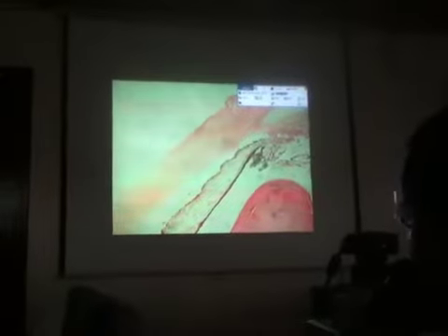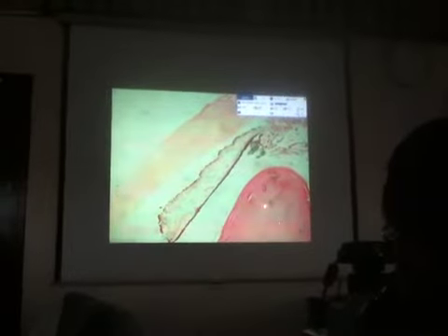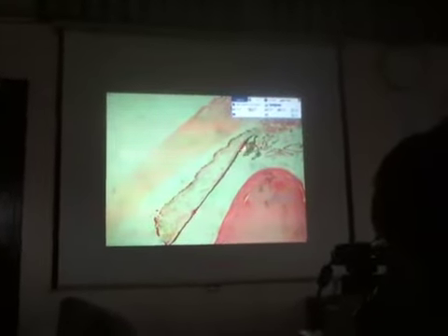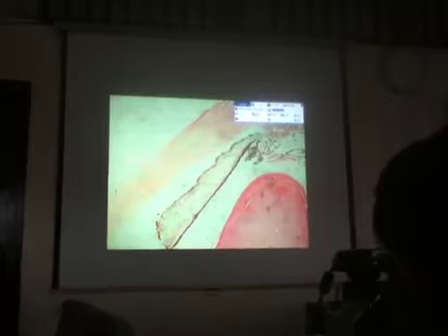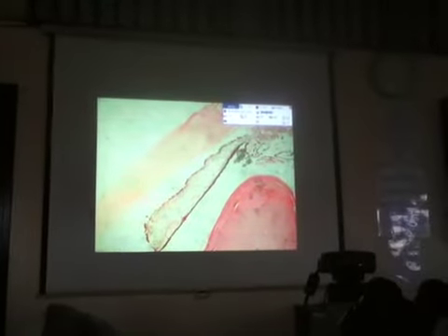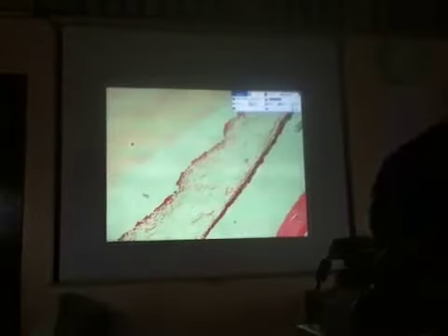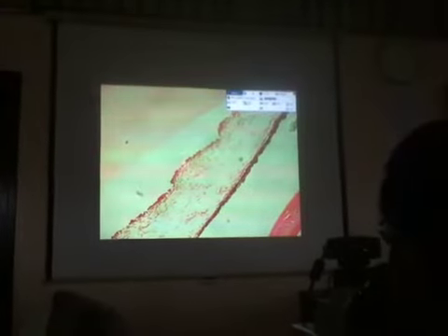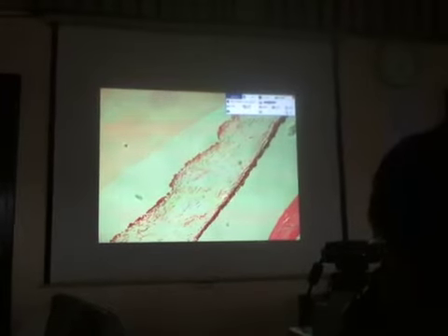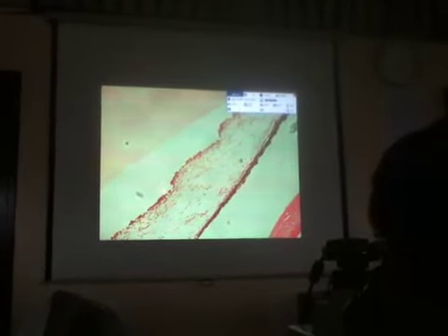So we have already characterized the lens and then the cornea. And then in between the lens and the cornea is the part of the eye which will give the pigmentation to the eye. Iris. Now, what pigment is present in the iris? Melanin. So those granules, which are actually golden brown in color, they are the melanin pigments.